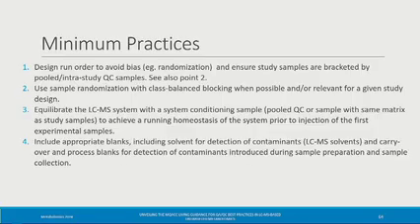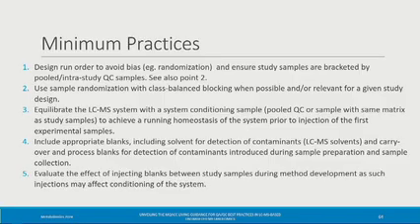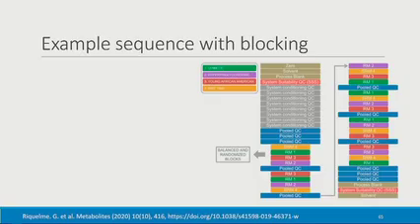And again, include a collection of blanks for detecting your contaminants and detecting anything that's gone awry while running your samples. And again, as a minimum, people really do have to evaluate the effect of injecting blanks while doing their method development. So here's just a couple of figures that I have to show what we're talking about here.